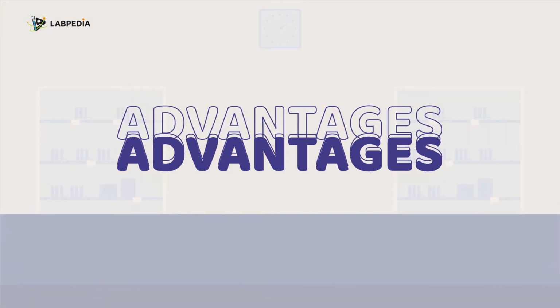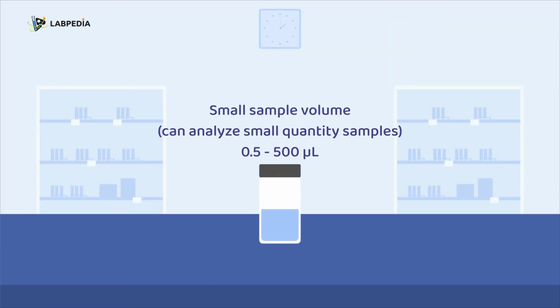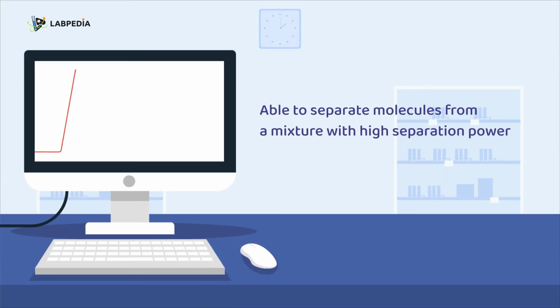Advantages: small sample volume, can analyze small quantity samples, 0.5 to 500 microliters. Able to separate molecules from a mixture with high separation power.